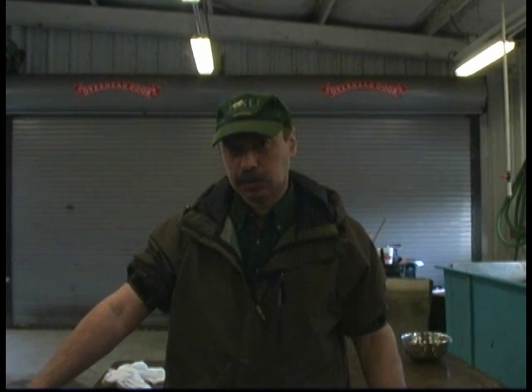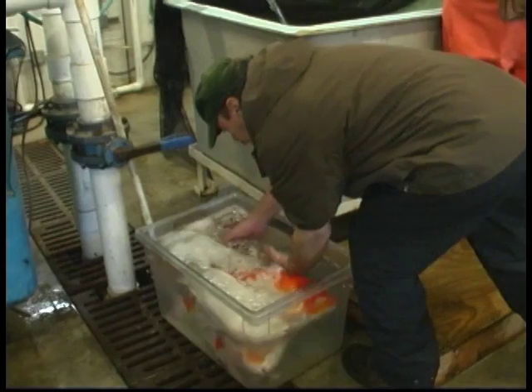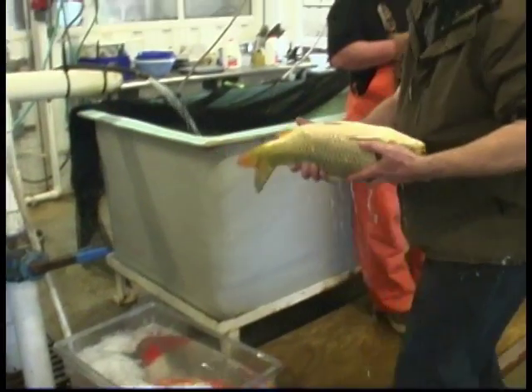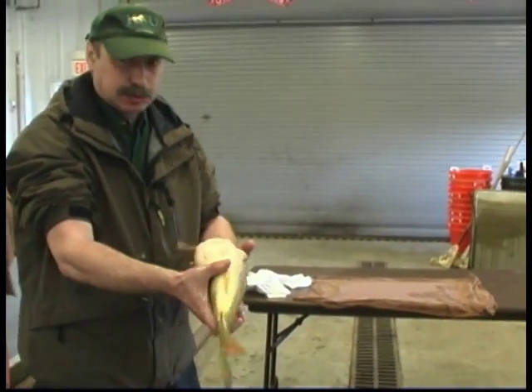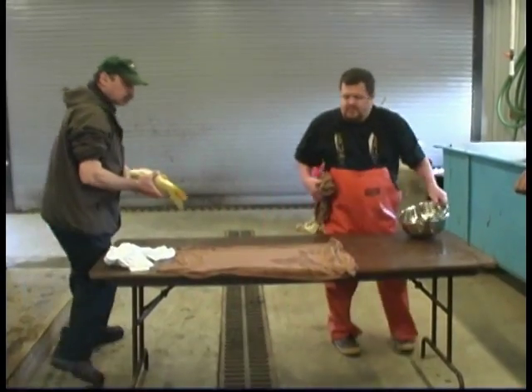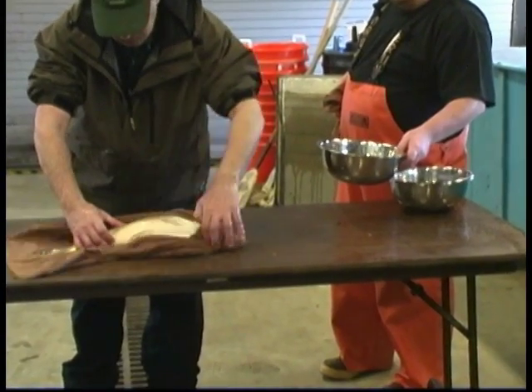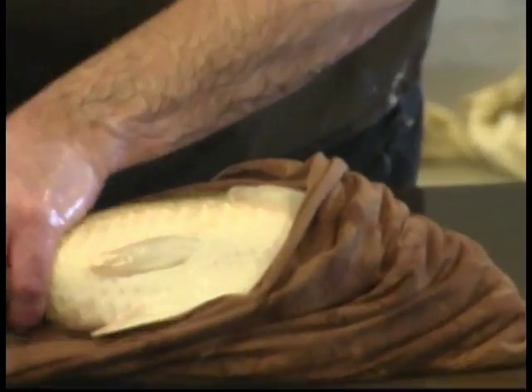We selected several females which are ready to be stripped. Now we will strip eggs from several koi females, including a ghost female. Now it's very important to wipe out all excess water from the fish before stripping.